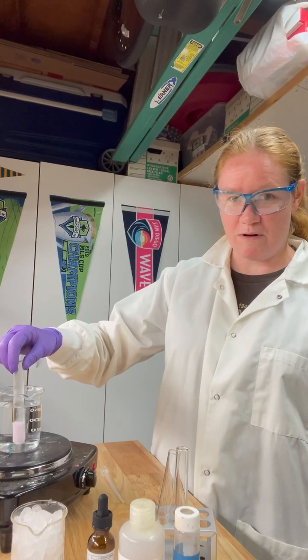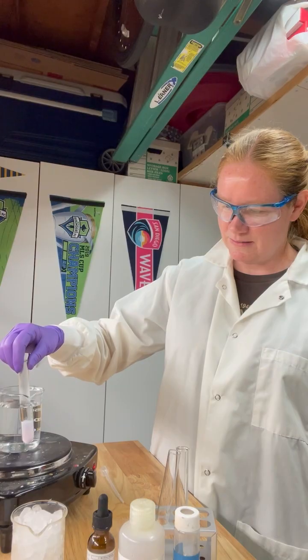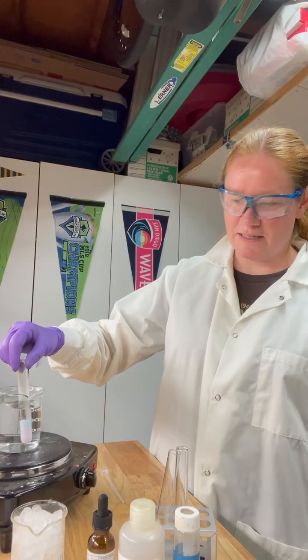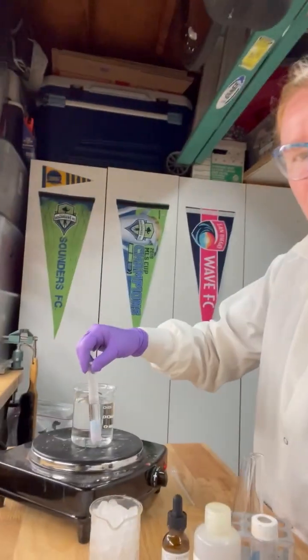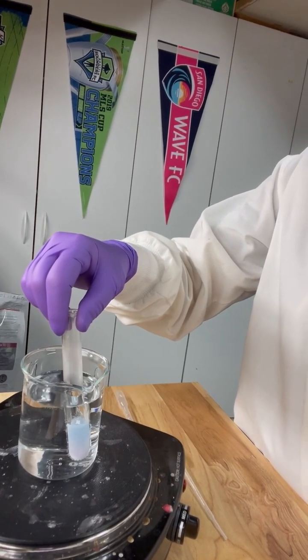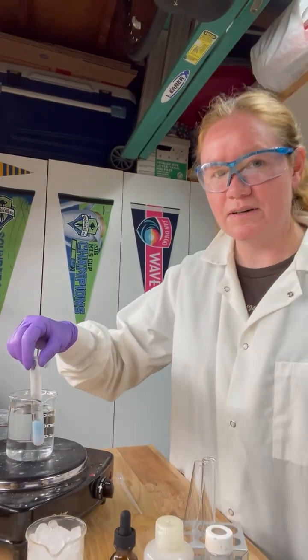Okay, we get in our hot water bath. You might be able to start seeing what's happening toward the top here. Here, I'll pick up the camera. So what's happening? What color are we getting as this is in the hot water bath? Is it staying pink or is it returning to blue?